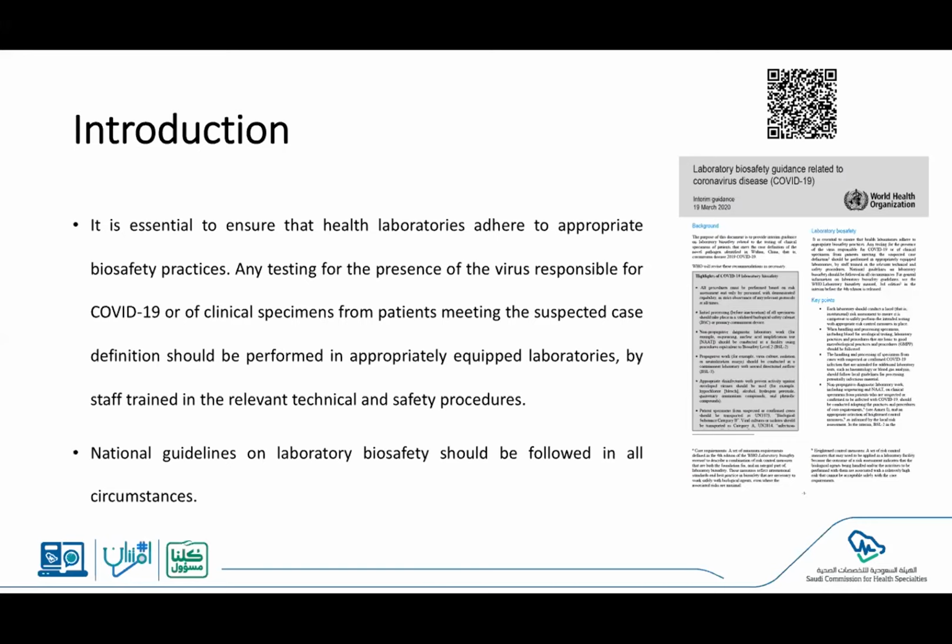on the right-hand side. If you scan the QR code on the top, you can have direct access to the document. This is the minimal requirement to make sure that it can be universally applicable to laboratories worldwide. But it's also highlighted in that document that national guidance on laboratory biosafety should be followed in all circumstances, which means the final call is actually made by the local public health agency. For example, in Saudi Arabia, we have the Saudi CDC as well as the Ministry of Health, which will make the final call on the requirements.